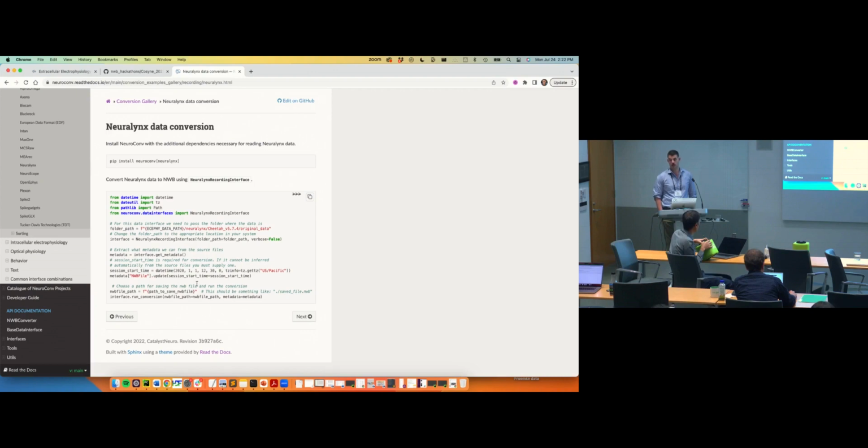Well, you're going to, of course, have to store that data. You can throw compression at it, which tends to help a lot. But yeah, it's more data. It's usually very small in comparison to the actual data, but it is potentially adding more data.